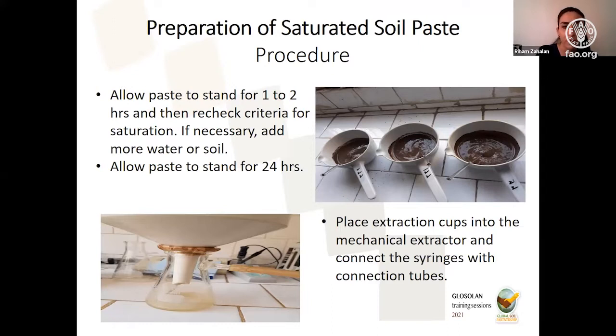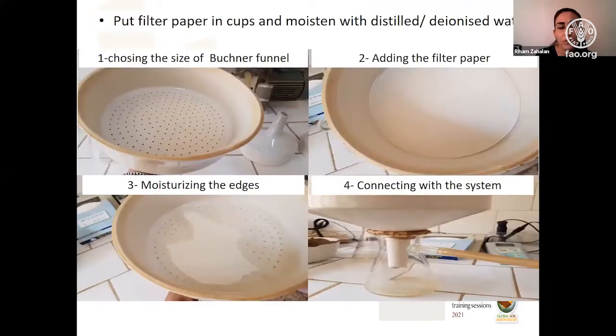Here I want to say some notes from our work in the lab. As Dr. Malhan mentioned, we have several sizes of Buchner funnels. You can use whatever you have in your lab, but if you have all the sizes available, I prefer to choose the bigger size or the medium size because it gives me a wider space, a bigger space to separate my saturated paste.